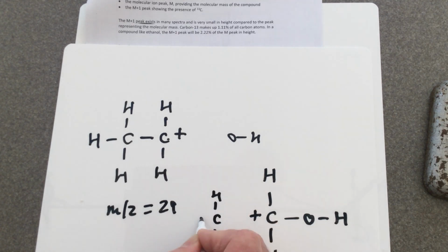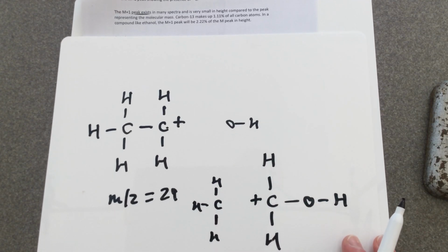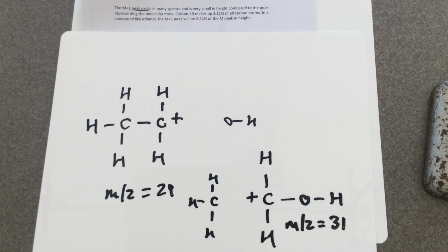So I would have broken the molecule between the 2 carbons. So this is a fragmentation ion which has an MZ of 31. So all I'm doing is looking at my molecule and trying to identify parts of the molecule that correspond to the same masses that appear on the MZ axis.